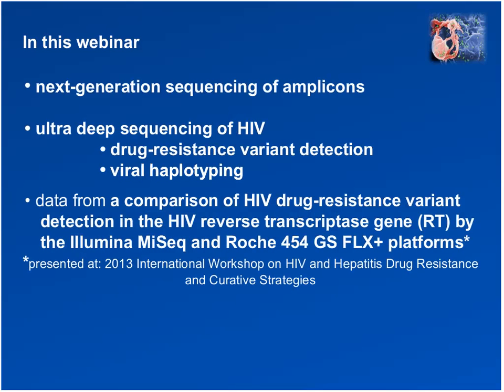The core of this presentation will be a discussion of data we generated here at the Gladstone to answer one of the most basic questions, a question that all of us lab scientists ask when faced with adopting a new technology in the lab or simply changing to a different instrument platform: will it work on our samples? In our case, we compared the performance of the Roche 454 GS FLX Plus and the Illumina MiSeq systems specifically for HIV variant detection.